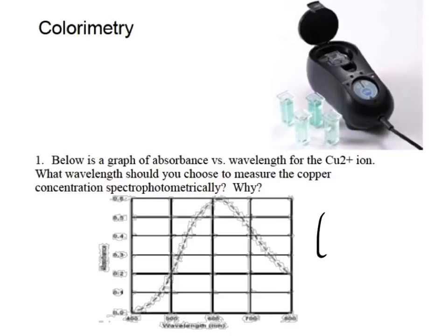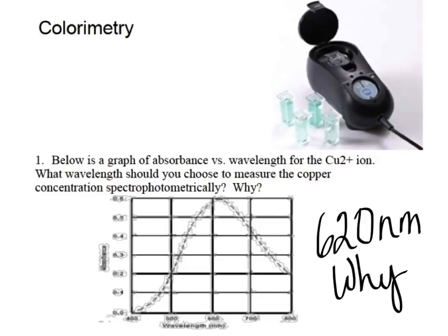Oh my goodness. 620 nanometers. And then in your pre-lab, answer why you've chosen 620 and not, I don't know, whatever that is, 800. Any questions on that? So in your pre-lab, you want to answer why you chose 620 and not something else.